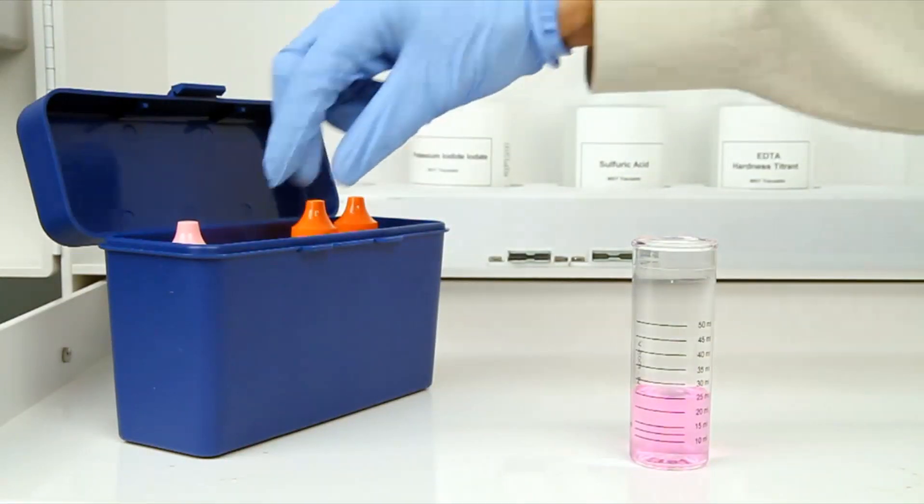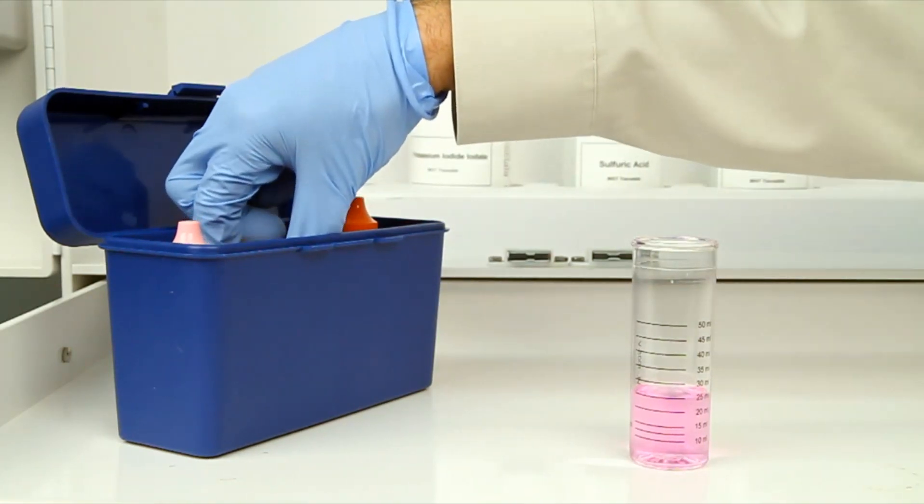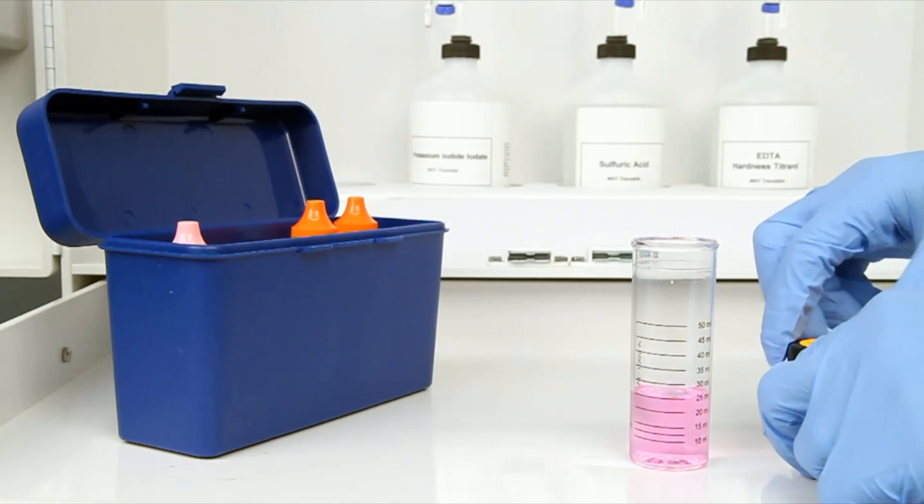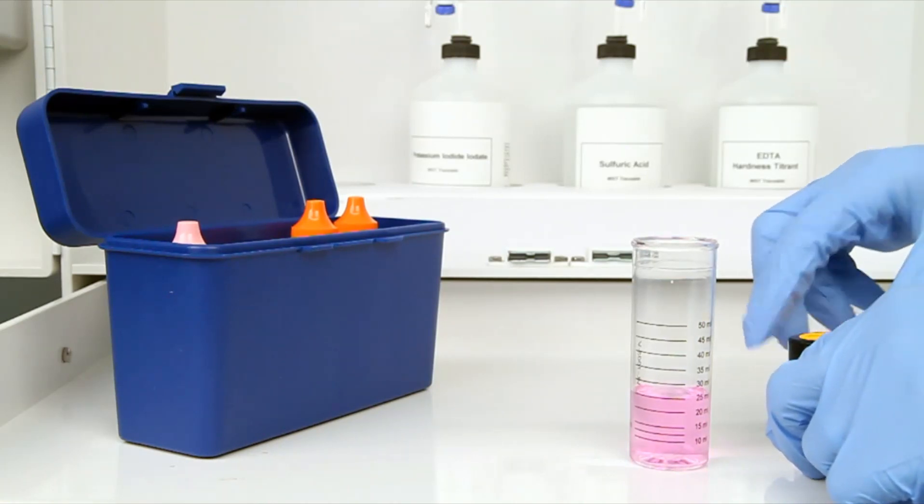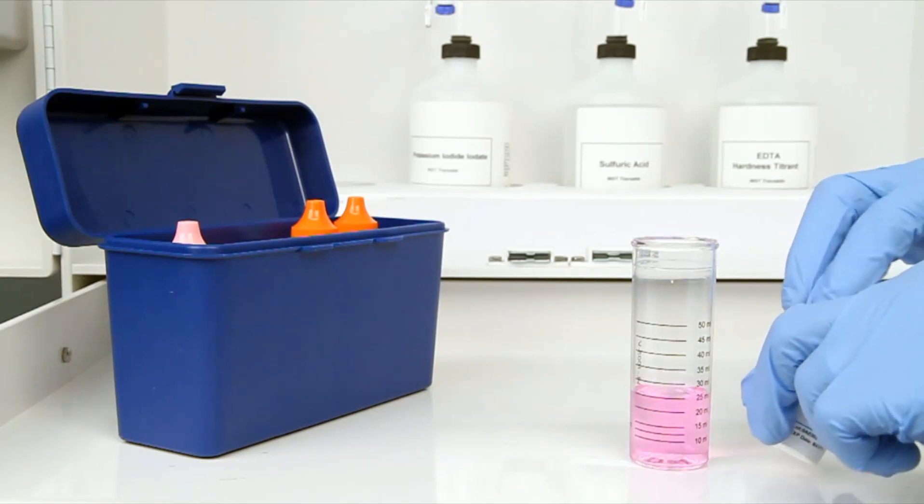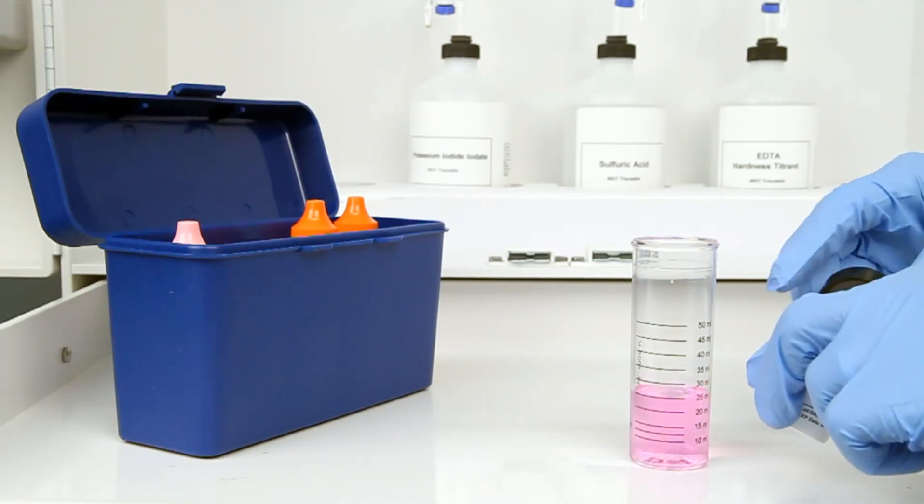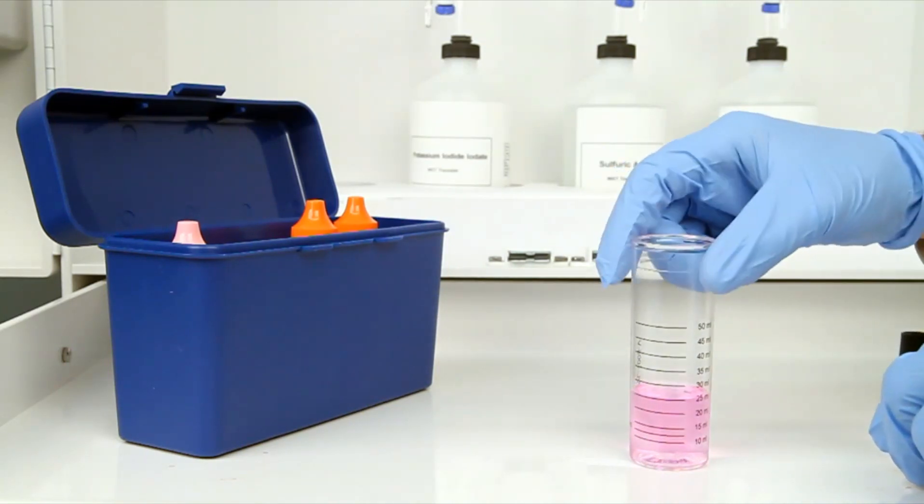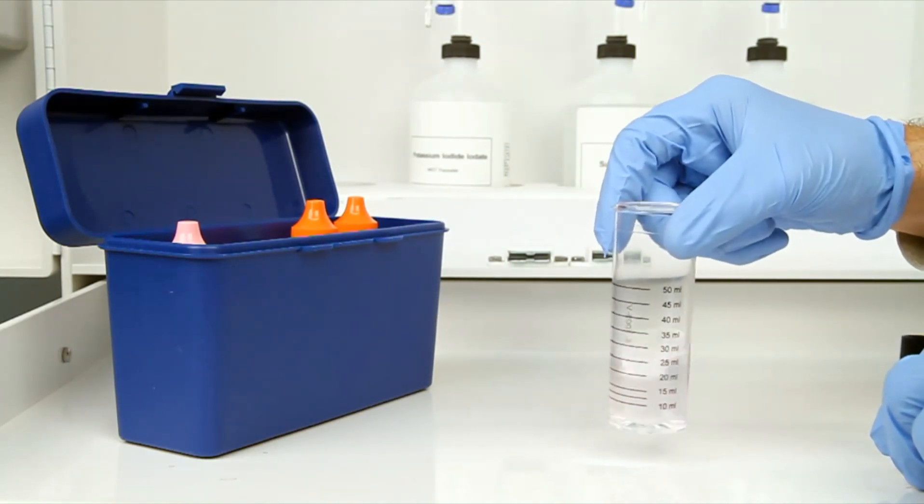The next step according to the endpoint ID procedure is to add the starch acid powder one scoop at a time until the sample is changed from pink to colorless. It's important to swirl the vial after each scoop to make sure the powder is completely dissolved.